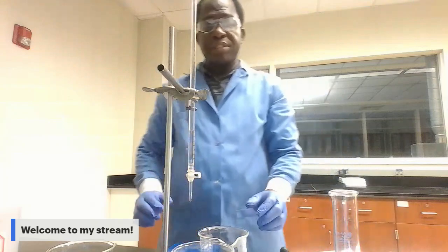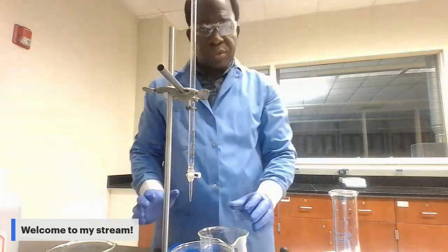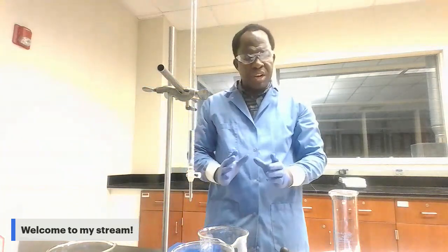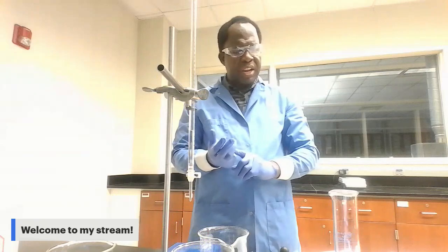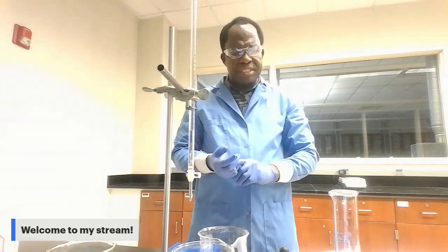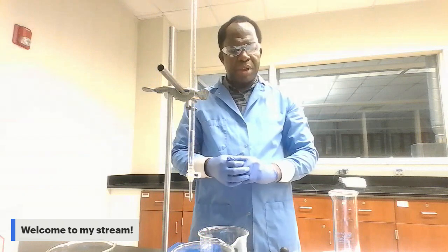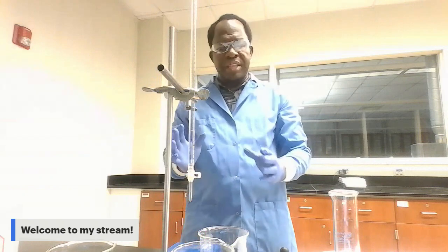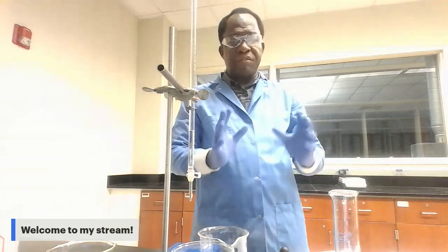So that's my third volume. First volume of HCl I use is 15 milliliter. Second volume of HCl 14 milliliter, and third volume of HCl is 14.5 milliliter. And at the end of the titration, you have to add the 3 volumes you get.